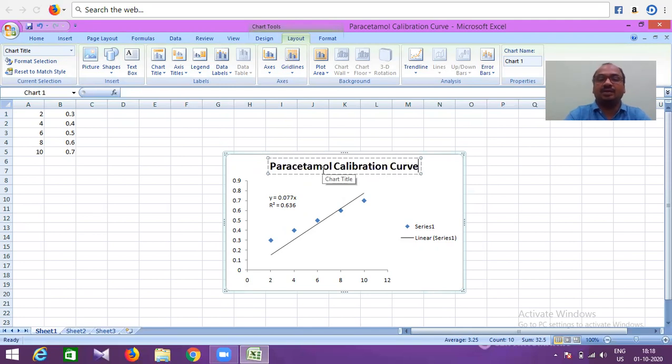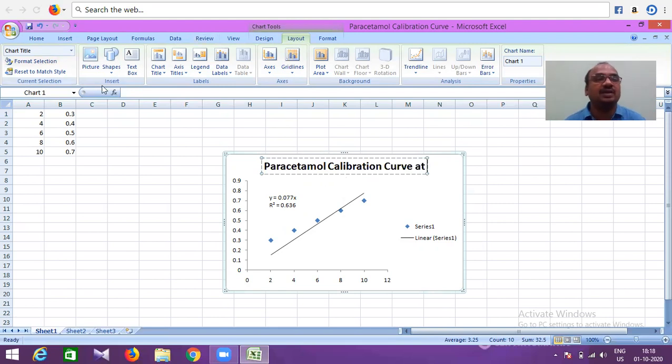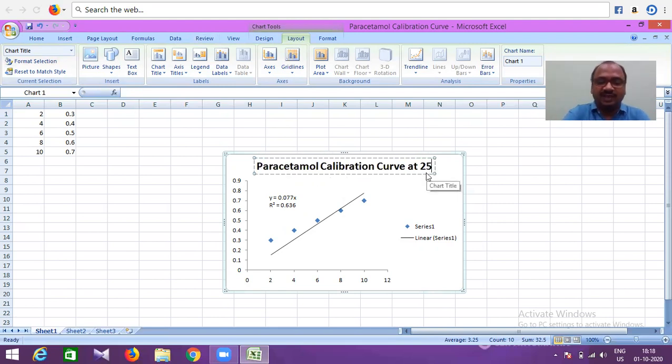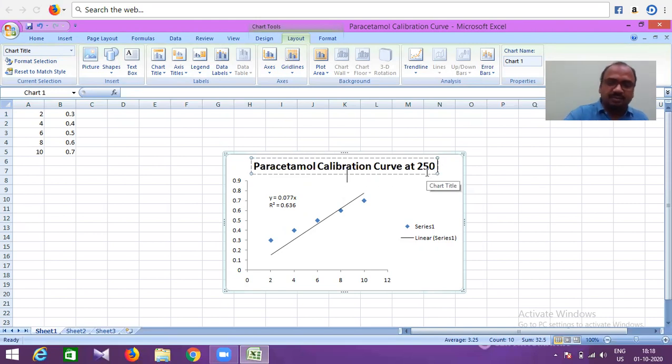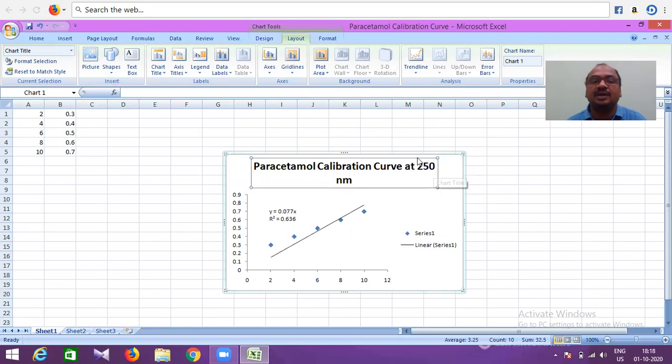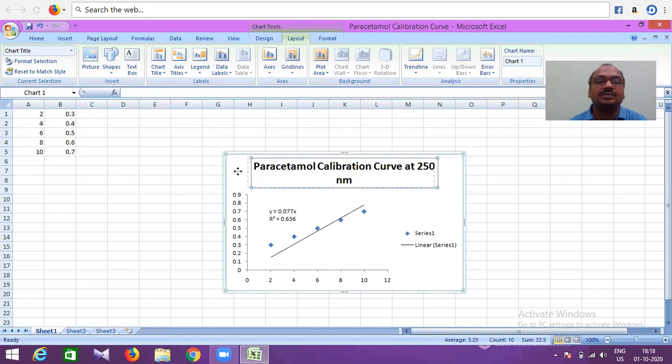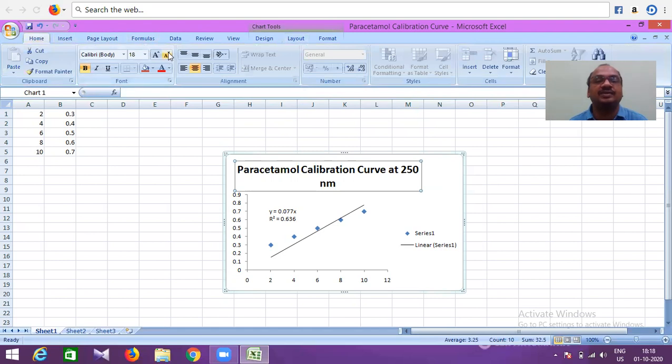At lambda max—which lambda max? Suppose 250. So at 250 nanometer. You can type nanometer. If you want, you can elaborate this one also, no problem. Or keep it like that. Or you can reduce the size also. Go to Home and reduce the size so it fits exactly.